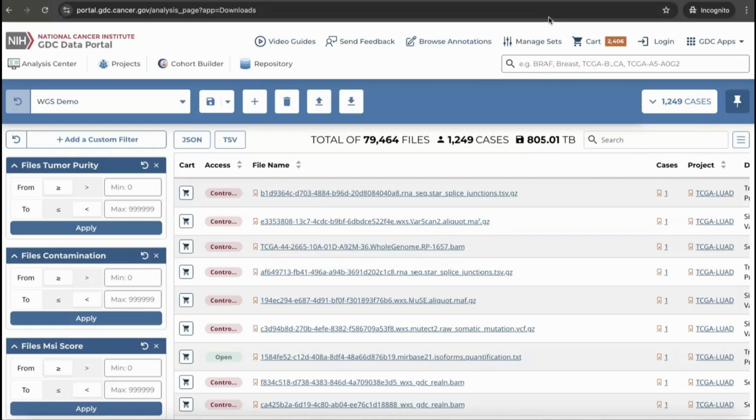We will derive more data, and once we have the ensemble map, we might look into how they compare. On the other hand, it's a little bit difficult to compare directly in the existing GDC dataset because there are no known truths there. I think there are some validated datasets from the TCGA that we have used for the whole exome calling.